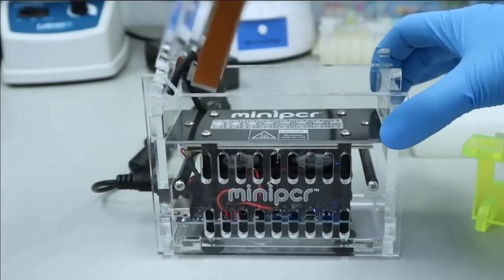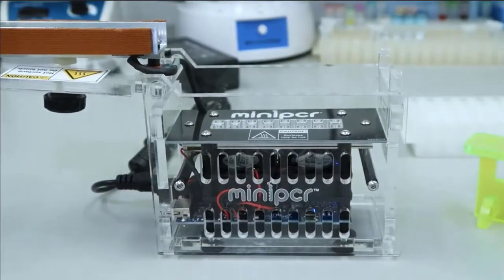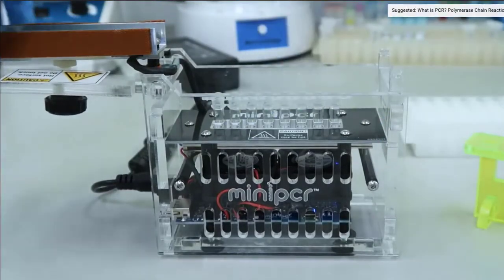DNA electrophoresis allows you to check and see if a piece of DNA of a specific size is present in your sample or not. This can help you figure out the likely identity of that piece of DNA, helping to confirm an infection, identify an individual by DNA fingerprinting, and more. It is especially useful after PCR to confirm whether or not you amplified a desired piece of DNA.